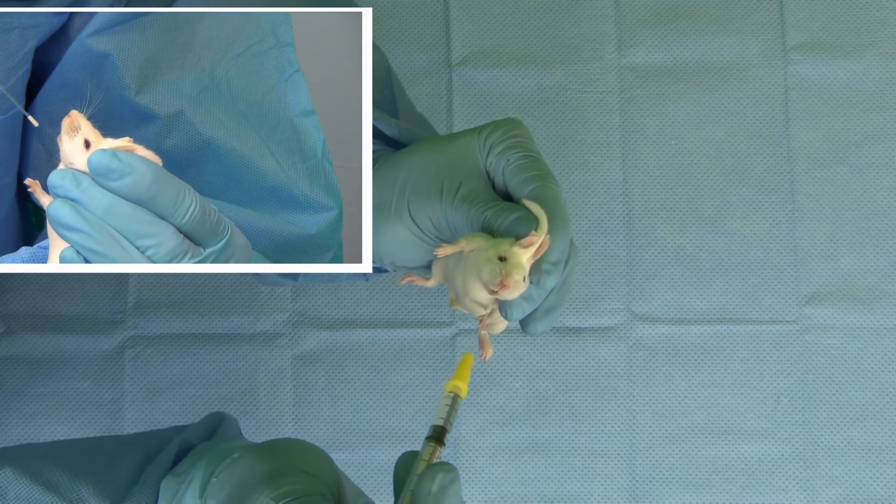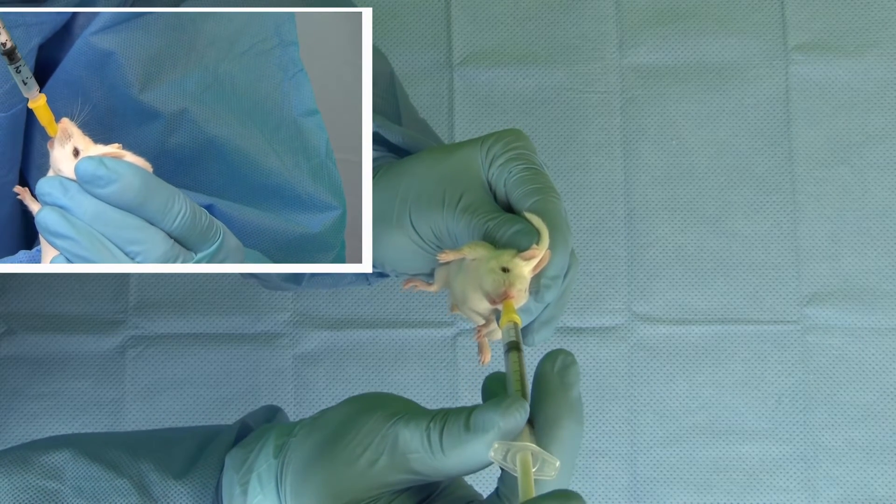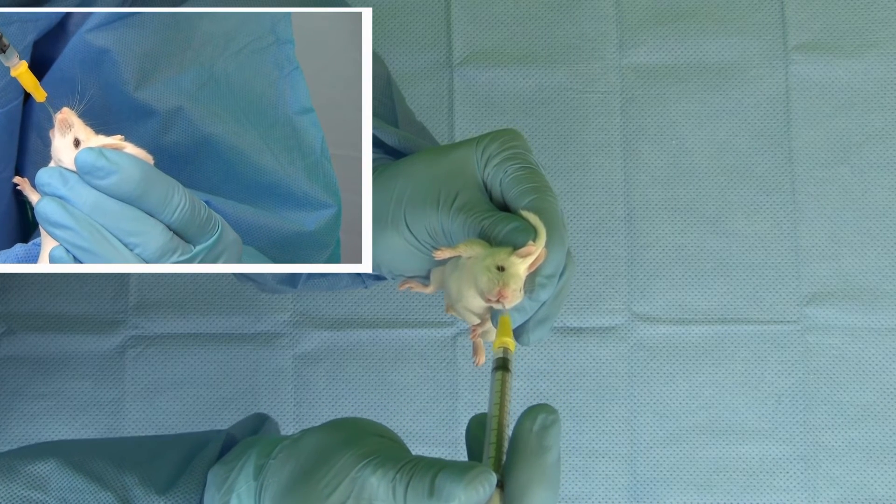The feeding tube should be inserted into the mouth to the right or left of midline. Entering from the side will reduce the chance that the mouse will bite the tube.